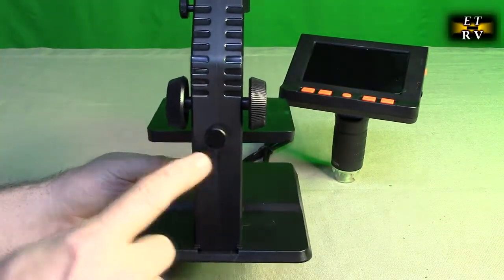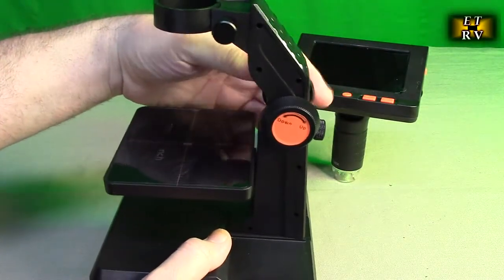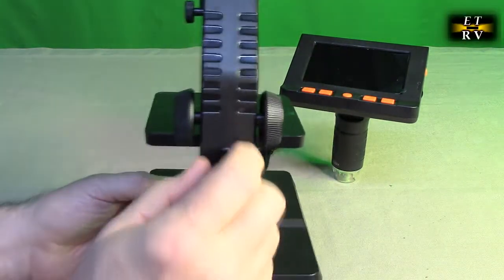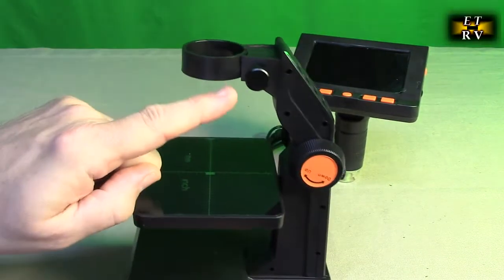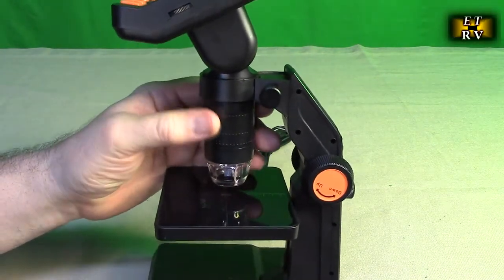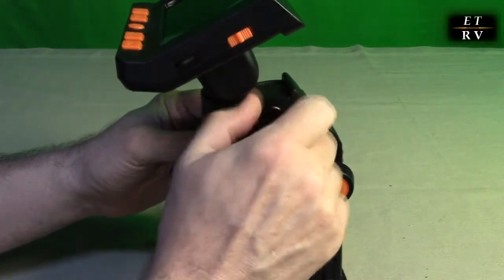Let's go over the mechanics of this. There is a thumb screw right here — when that is loose, the up-and-down knob allows the table to move up and down for the rough focus. Once you have it locked in place with whatever you're observing, you can turn this clockwise and that will lock the table in place. On the top there is another set screw that locks the whole unit up on top. You turn this to the right and it locks in place.